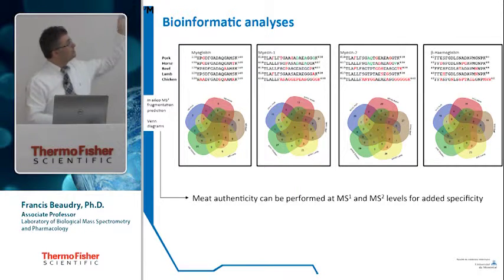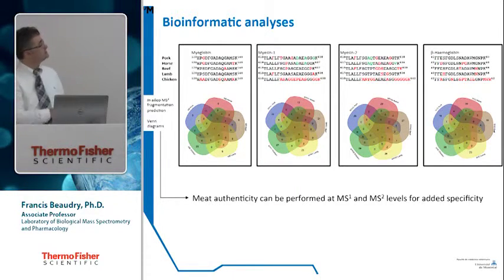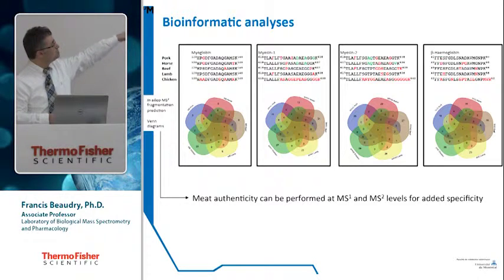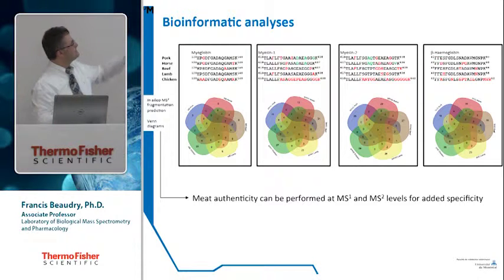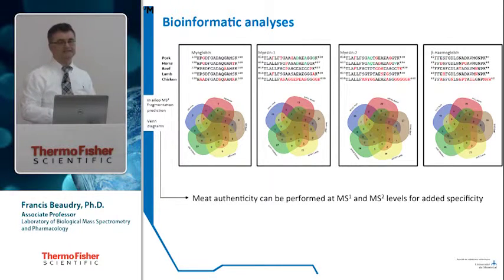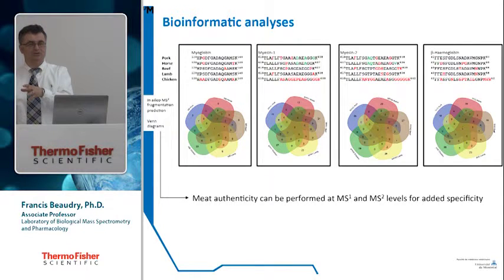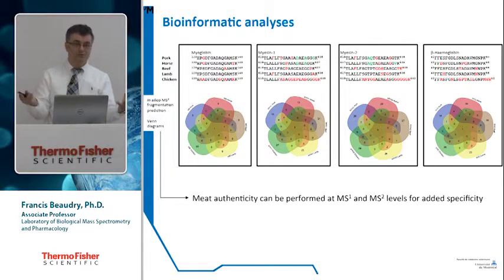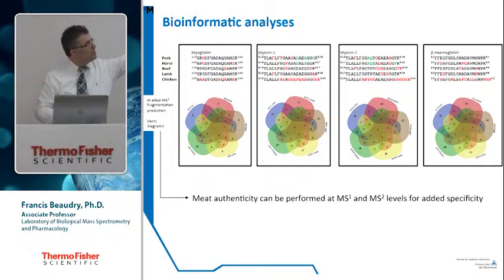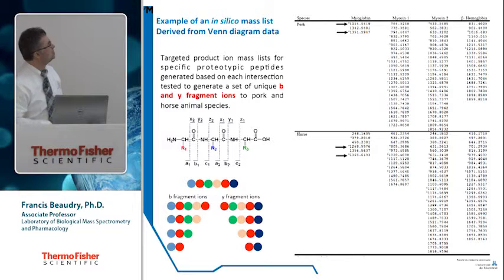So the other question is, when I look at those sequences and the differences between the sequences, and you align them, and I look specifically into the MS2 fragments, what I see in there, and it's very important, is that there are distinct fragments for each of the species. So not only are the precursor ions distinct, but I do have distinct fragments as well. So the pair of precursor to fragment ion is very specific to each species. So the chance of false positive or even false negative is almost none. So this is a high strength. Same thing with myosin, myosin 2 and beta hemoglobin.